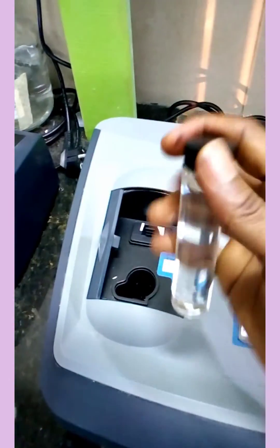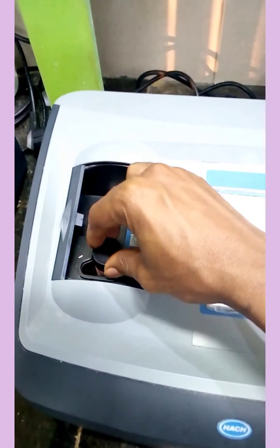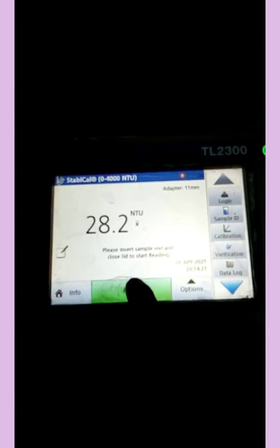My sample here is de-mineralized water. I fill it into the cell, then close the cell properly, and place it inside the sample cell compartment of the meter.